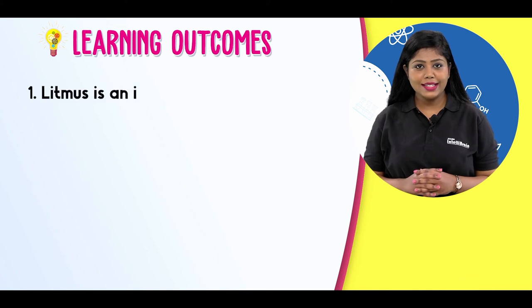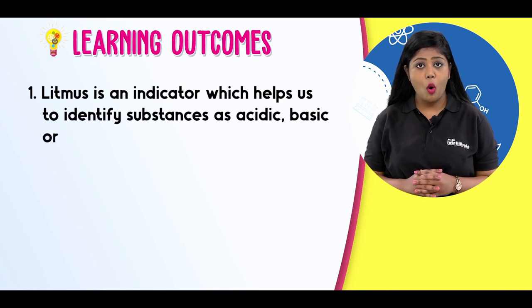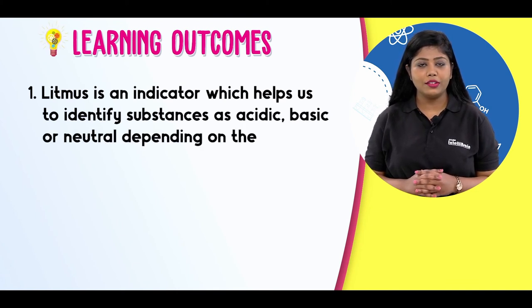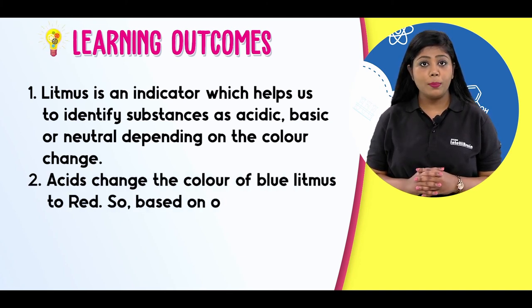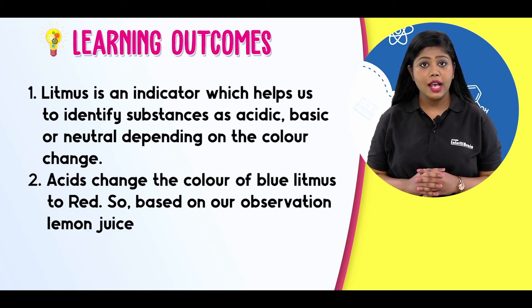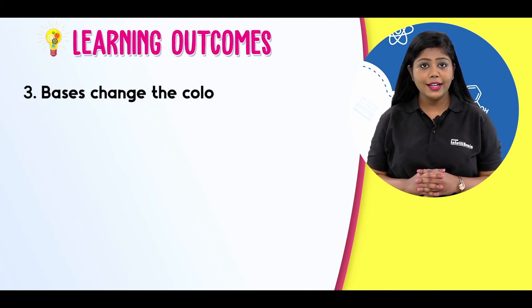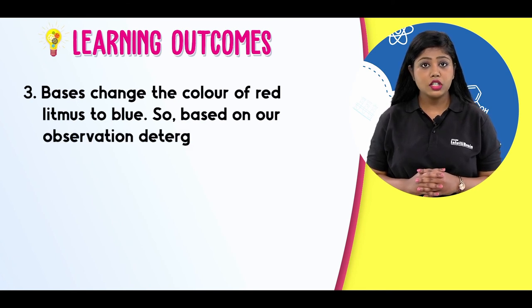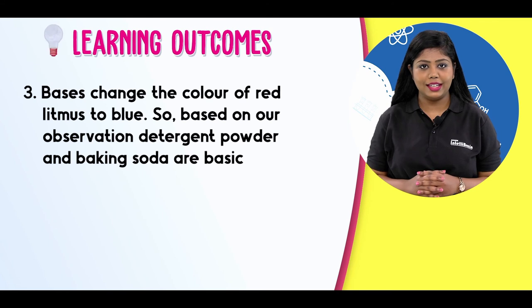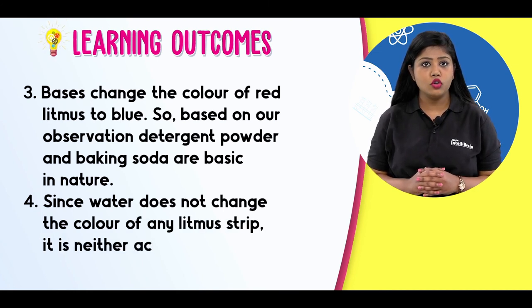Litmus is an indicator which helps us to identify substances as acidic, basic or neutral depending on the color change. Acids change the color of blue litmus to red. So based on our observation, lemon juice and vinegar are acidic in nature. Bases change the color of red litmus to blue. So based on our observation, detergent powder and baking soda are basic in nature. Since water does not change the color of any litmus strip, it is neither acidic nor basic.